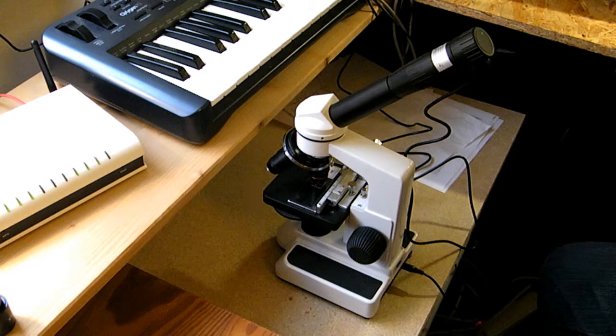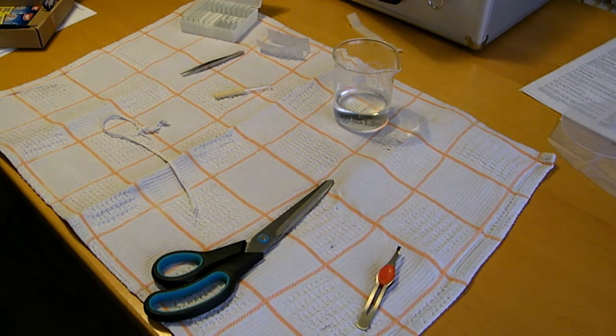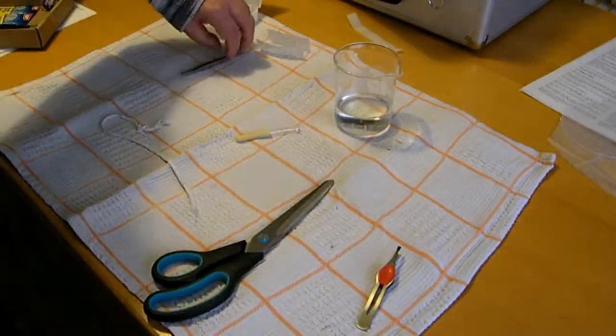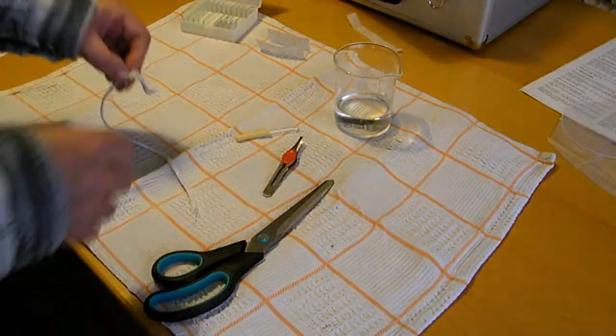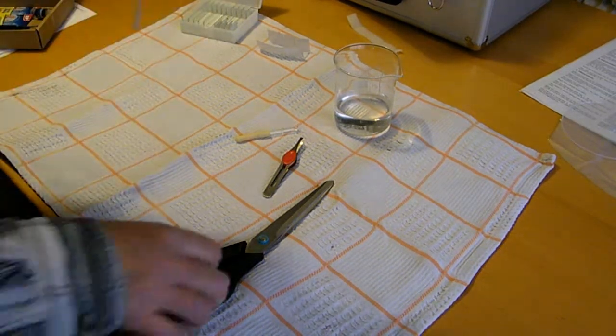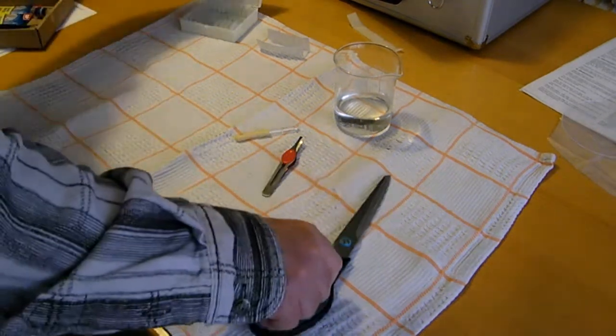All right, it seems to work. Now let's try something else. I have read a little bit in the manual. There are some tips for first experiments, so I have got myself a little bit of water, a pipette, and a pair of tweezers, well, two pairs, but I will use this one. And I'm going to observe this thread of textile. So I cut off a piece.